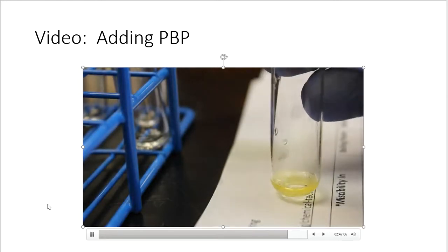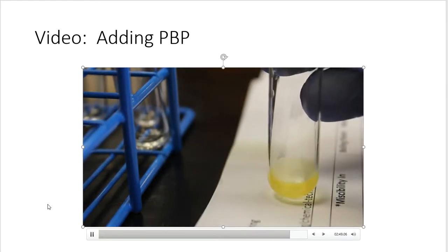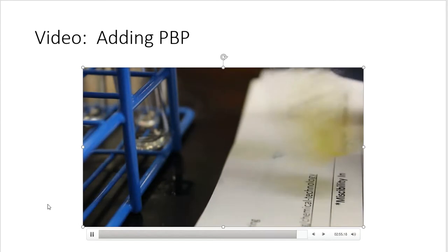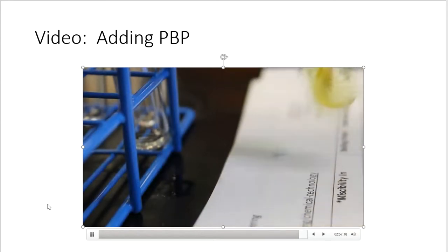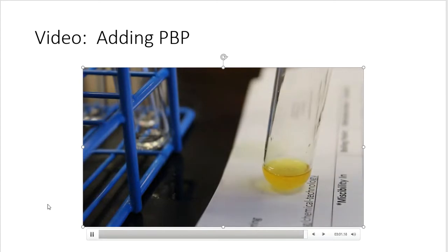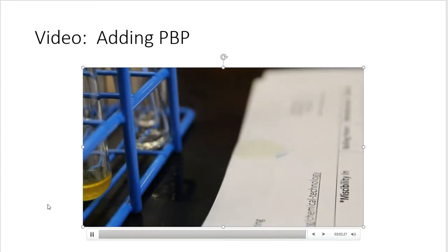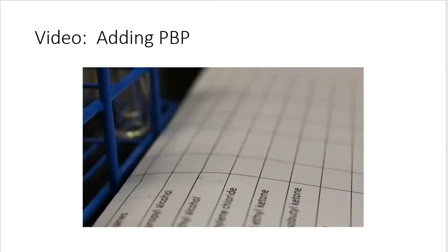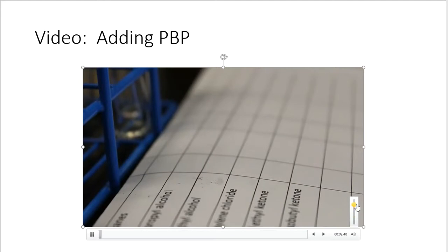And then we'll just add 10 more, just to be consistent. There you go. Okay, so I'm moving on to the others.